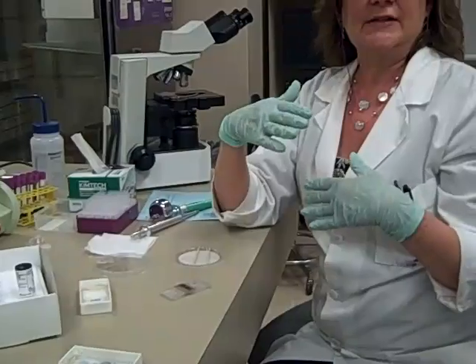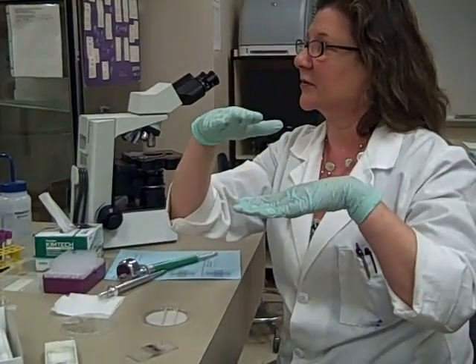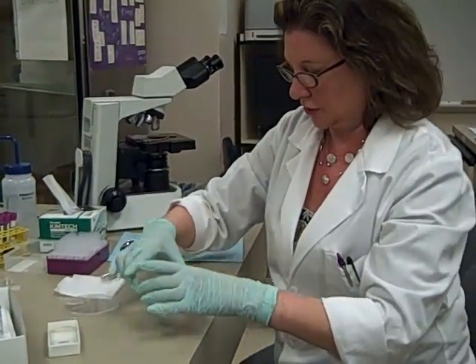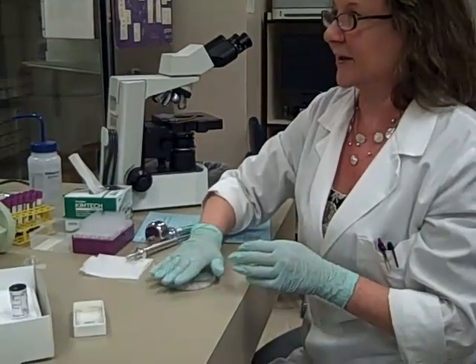If we didn't wait for the cells to settle all into the same focal plane, you'd have one cell up here, one cell down here — it'd be hard to focus. So we're going to put them in our chamber for just a minute and let them settle out.